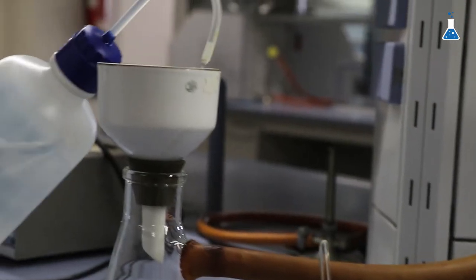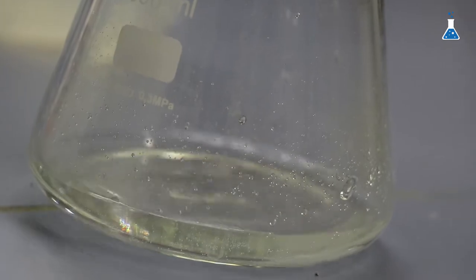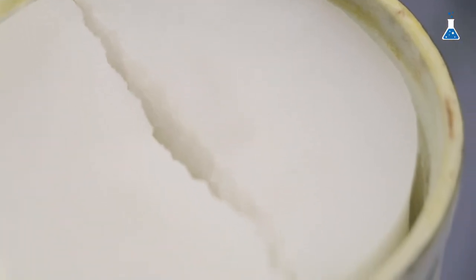Now we are going to filter off the gelatinous precipitate in a Buchner funnel placed in a filter flask, which is connected to the vacuum pump.